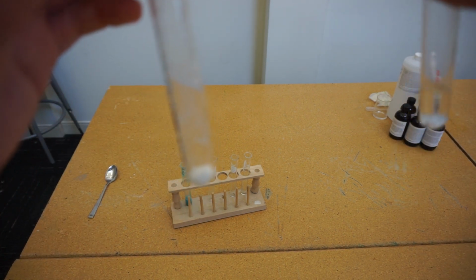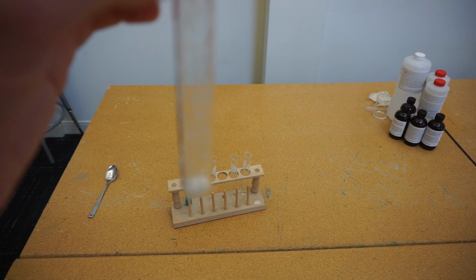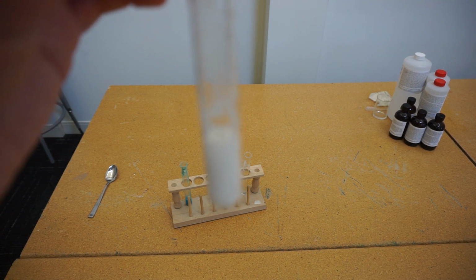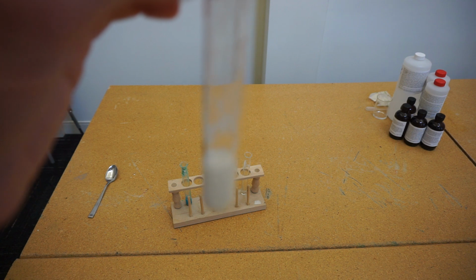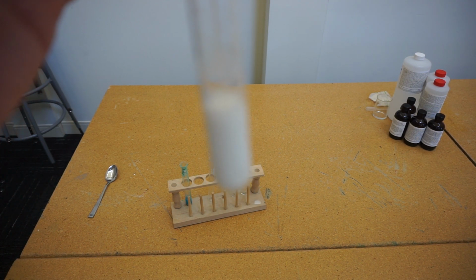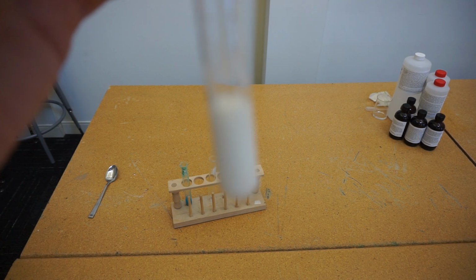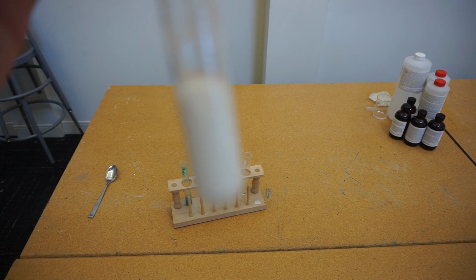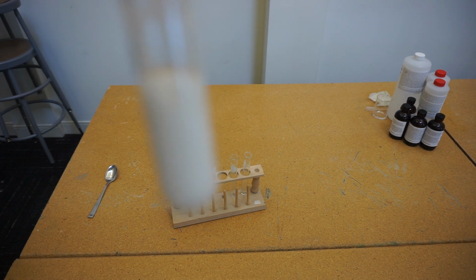Second sign, as we said, is production of a gas, and again you can see that very clearly. It's the exact same reaction, only this time we've used calcium carbonate with sulfuric acid, so we'll be producing calcium sulfate, water and some CO2 gas. And a quick question to think about: what sort of reactions have been taking place with these two?